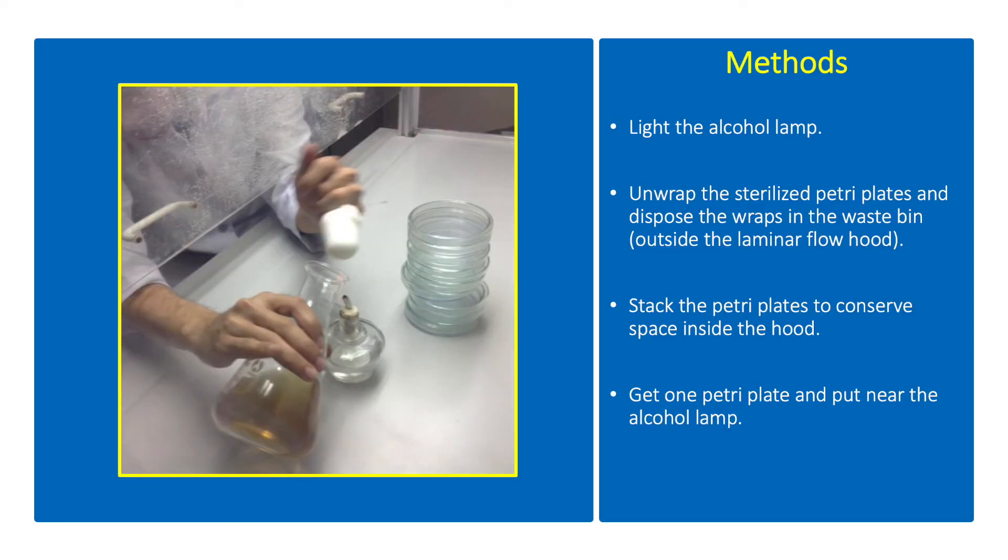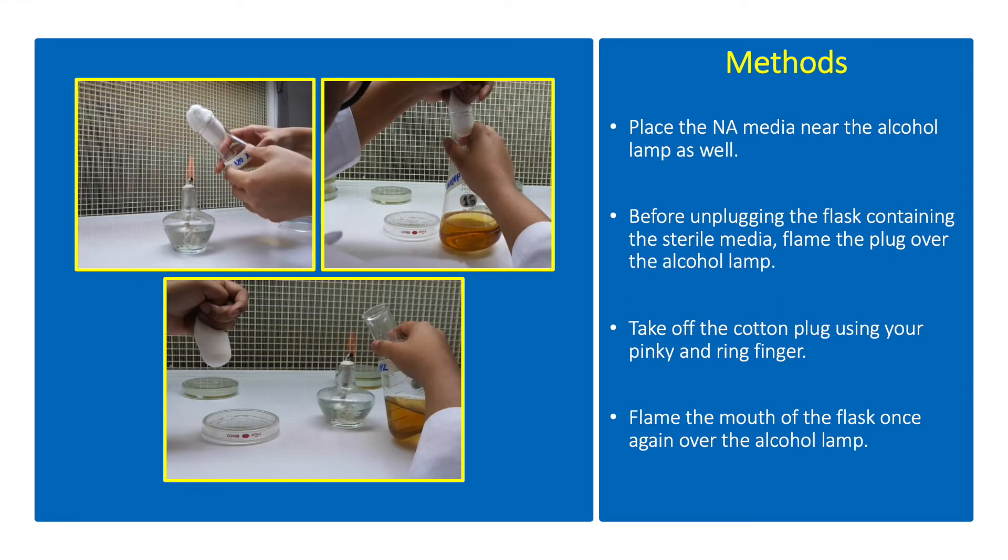Light the alcohol lamp. Unwrap the sterilized petri plates and dispose the wraps in the waste bin. Stack the petri plates to conserve space inside the hood. Get one petri plate and put it near the alcohol lamp. Place the NA media near the alcohol lamp as well.